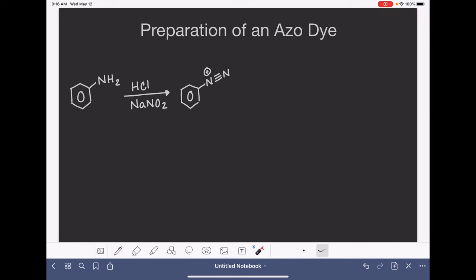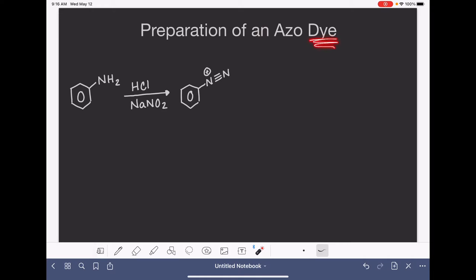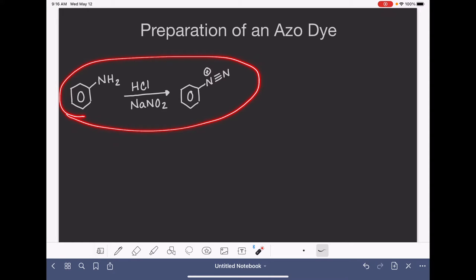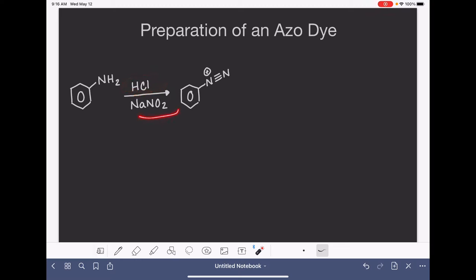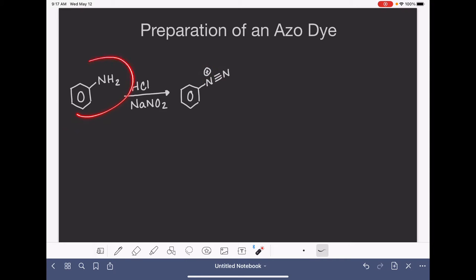In this experiment I'm going to be synthesizing a type of molecule called an azo dye — literally a dye like what we would use to color fabrics. This reaction is a two-step process. It starts with a diazotization process, where I'm going to be converting aniline into a diazonium compound. This is done using hydrochloric acid and sodium nitrite (NaNO2, not NO3), and this process converts the aniline NH2 group into a nitrogen-nitrogen triple bond with a positive charge.